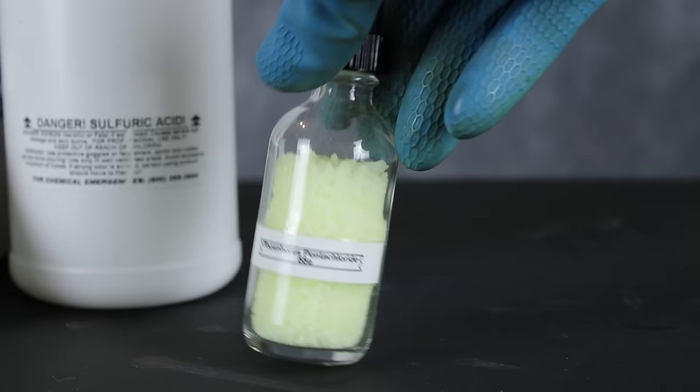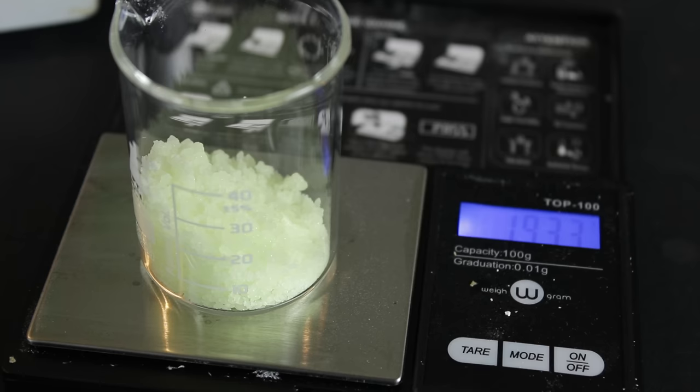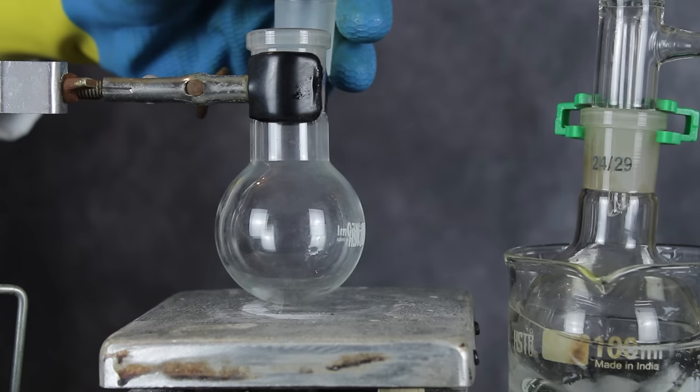He sells a ton of different hard-to-find chemicals, so if you ever need something like phosphorus pentachloride, be sure to check him out. To start this preparation, 20 grams of phosphorus pentachloride was measured out. You can see it comes in these nice greenish crystals, which to me smelled a lot like weird parmesan cheese. And before anyone freaks out, yes, I did put on my respirator and other protective equipment.